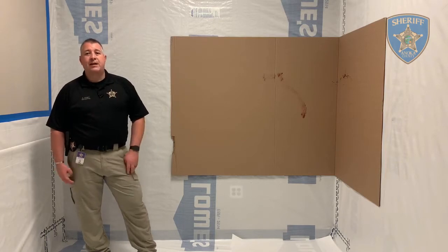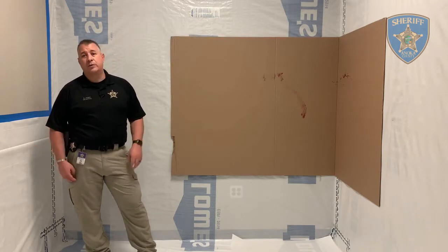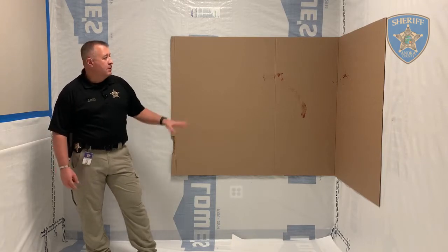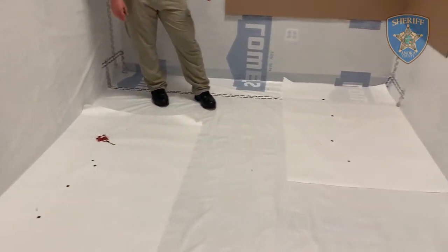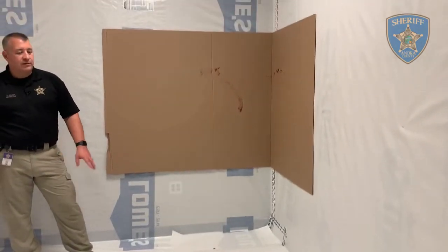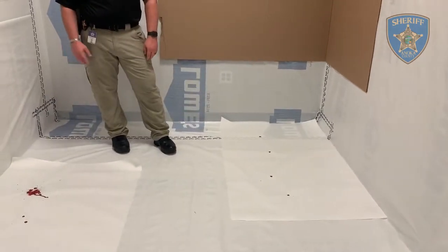One of the disciplines that we have is blood stain pattern analysis. This room right here is set up for detectives to practice because this is one of the disciplines that if you don't practice, you kind of lose those skills. So what we do is we put up Tyvek, we put up cardboard, craft paper, and then we throw blood around for us to practice because when we get on a real scene, you want to have your skills honed the best you can. If you look around here, you see on the floor we have a drip trail, which is blood that's dropped as the suspect or an object is dripping blood off of it.